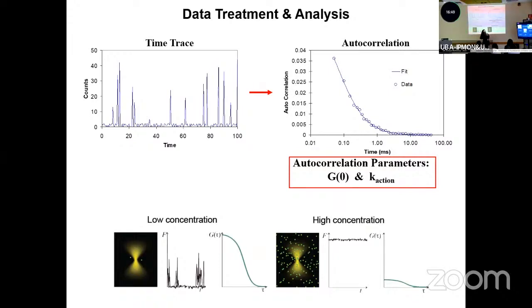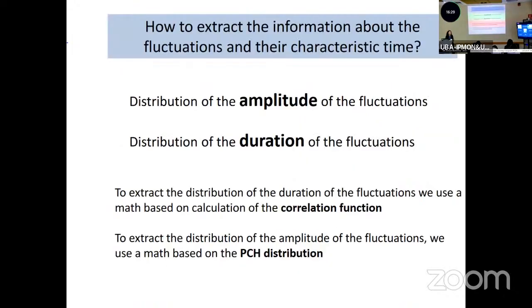So it's almost like the probability of seeing that same molecule in a short time scale. If it's diffusing very quickly, you're going to get this very sharp peak. But as it diffuses slower, you're going to get more correlation as a function of time, and then it eventually is going to decay. It's going to just go down.